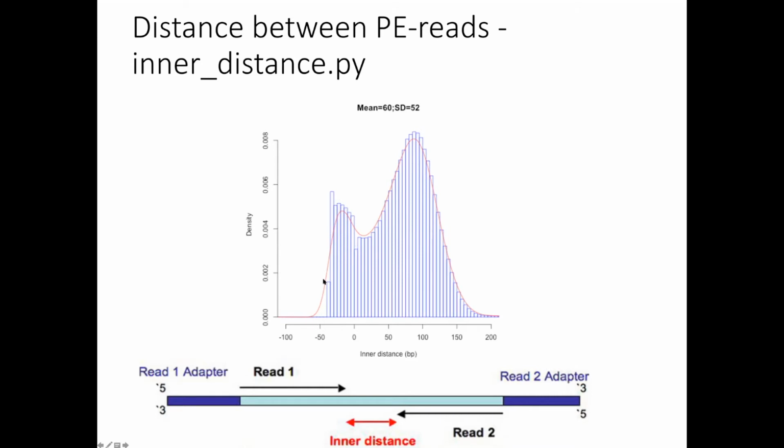So for these ones, it would have been better if the distance was bigger, because now a part of read 1 and read 2 are giving the same information. That's what you can see here.